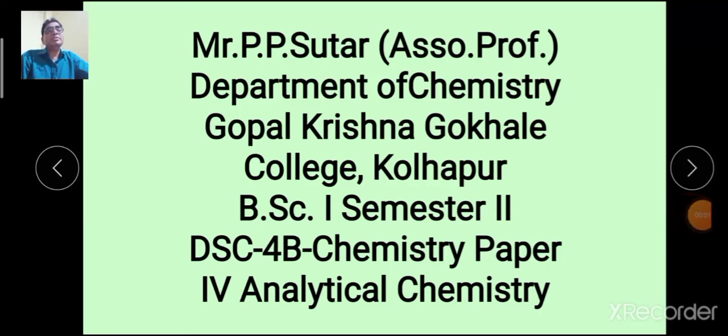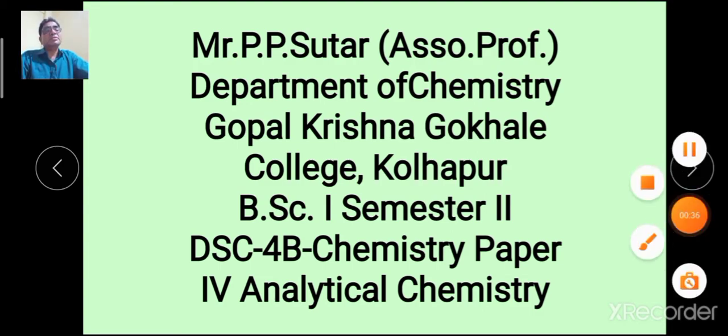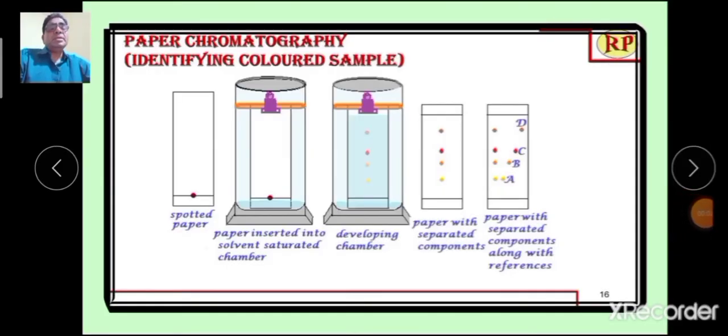Welcome students. In the previous lecture, we have seen the introduction of chromatography, classification of chromatography, and some basic information about paper chromatography with the types of paper chromatography, that is ascending paper chromatography and descending paper chromatography. Now we are proceeding further. Now students, let us see in detail the paper chromatography.